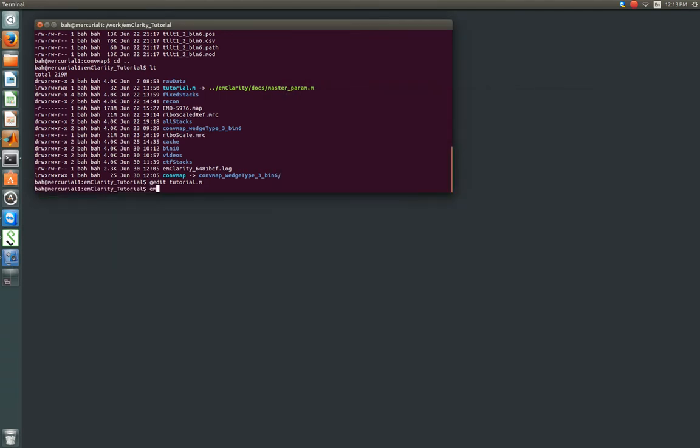So up till now we've had to keep track of a decent amount of things. But from here, once we enter the emClarity workflow, everything is kept track of in this binary file for you. There shouldn't be anything else we need to change at this point. So we'll close that file. Now we're just going to run emClarity. The command is init for initialize. And all we need to give it is the parameter file. And we'll send that job off and check back when it finishes.